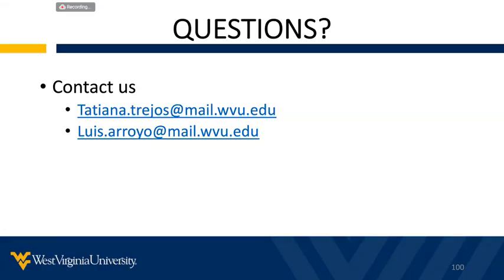One of the things that we are trying to elaborate in our second year of operations, so that we can start pilot testing, is that because of the low cost of this instrumentation and its high versatility, in particular because we can use portable instrumentation and in-lab instrumentation, we anticipate that it can be easily adopted at the crime scene and at the laboratory. And that's something that will play an important role in this project.